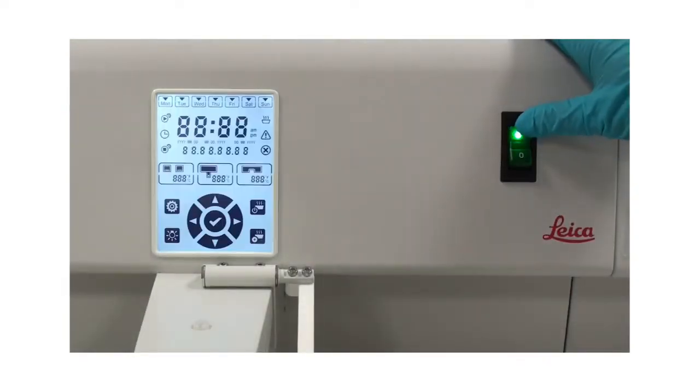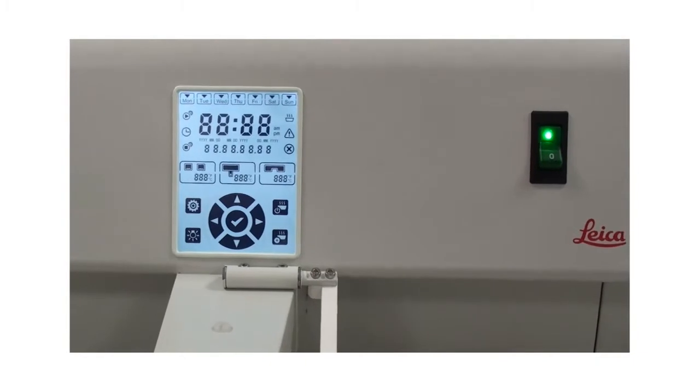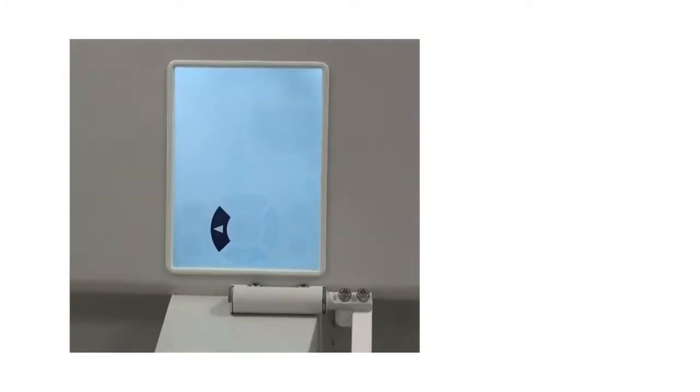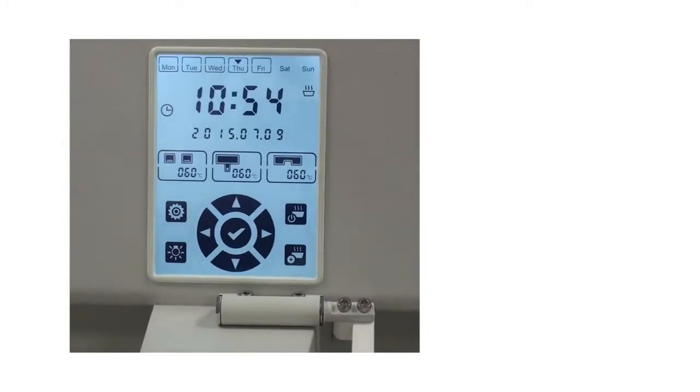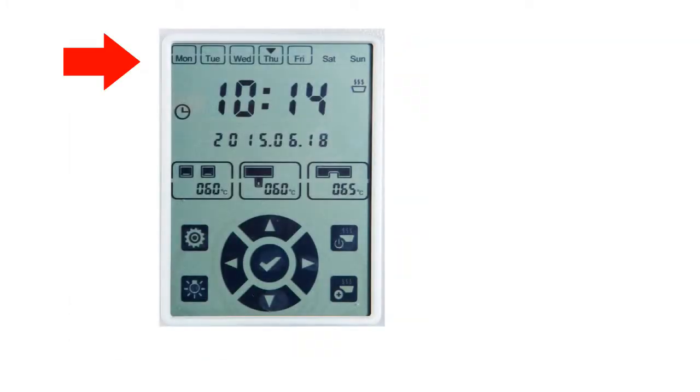Switch on the instrument and control the embedding system with a backlit touch screen. All relevant information is indicated here, such as working days, current time and defined start and end time, temperature of trays, paraffin tank and the working surface, a melting indicator, temperature, plus set up and light buttons.